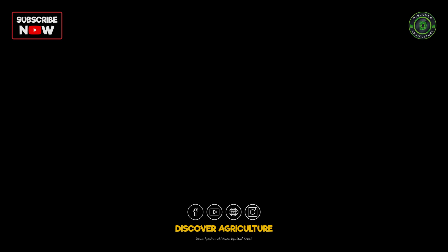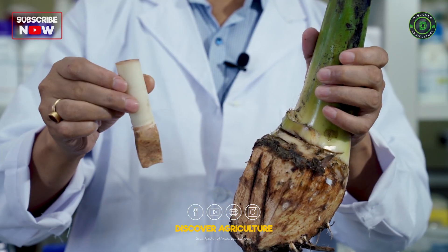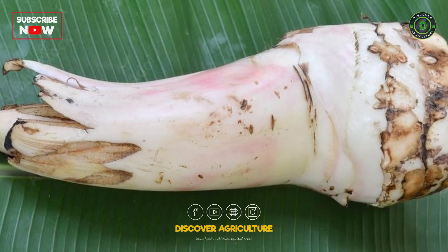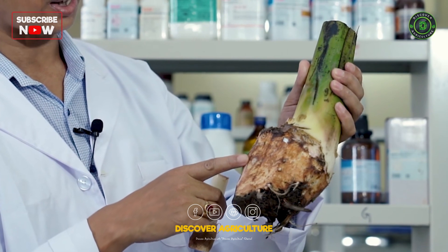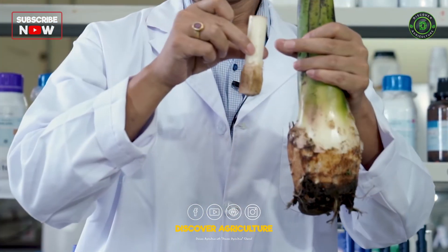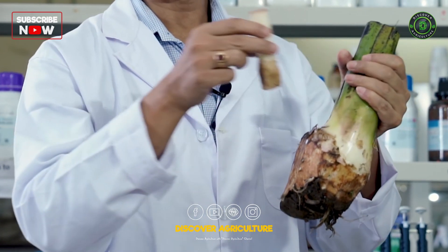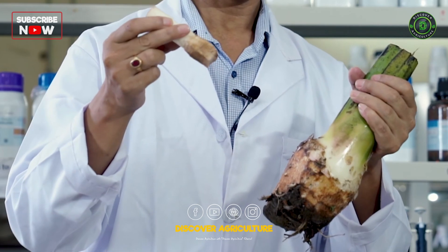Extracting the shoot apical meristem. We start with the banana plant sword suckers. From these suckers, we extract the shoot apical meristem. This explant has two main parts: the lower portion, known as the rhizome, and the upper portion, known as the pseudostem. By carefully extracting the inner portion of the rhizome and pseudostem, we obtain the inner shoot meristem, which will be used for micropropagation.